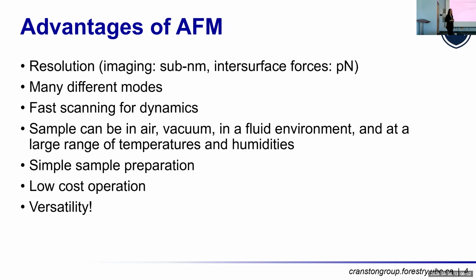We can get a lot from this one technique. And so, of course, we've got imaging with sub-nanometer resolution, measuring forces between surfaces in the range of piconewtons. There's tons of modes. I'm not going to list them all today, but both for imaging and for measuring forces. We can now do fast scanning and fast imaging to get information in real time. That's something that our AFM can do, so we can look at crystallization of materials.